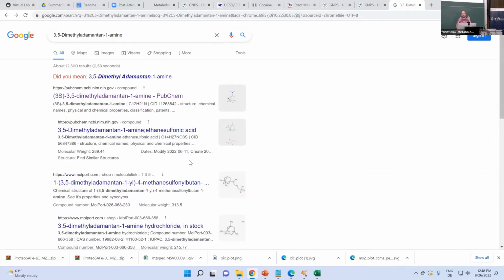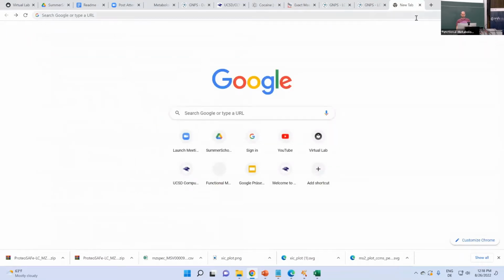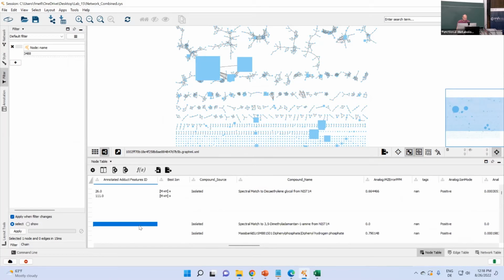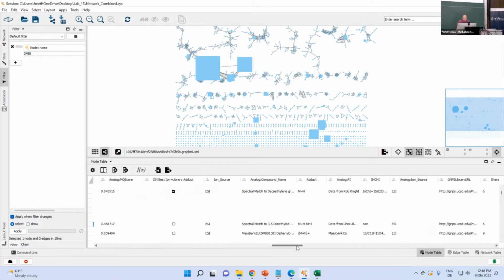But I think often for compounds, if they're widely known, you will get good hits in Wikipedia and so on. Then if I don't find anything but have a SMILES code, I visualize it in ChemDraw or ChemSketch, what I showed you the other day, which at least gives me an idea from a chemical perspective. Let's see if there is a SMILES code.